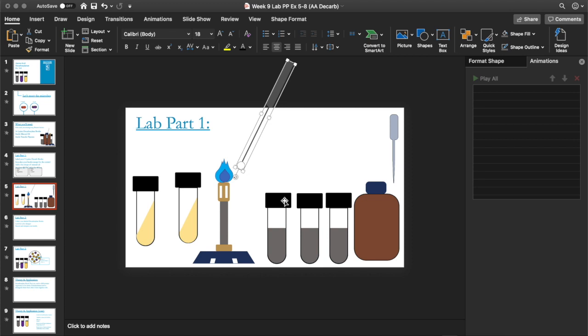Now there's one more step in this lab experiment, and that is to add the mineral oil. This is critical because the mineral oil is absolutely necessary for this test to work properly. So of course, you want to work near your Bunsen burner in order to maintain sterility. What you'll do is just take the top off, use your sterile transfer pipette, grab some mineral oil inside, and pour a few drops into the test tube that you've just inoculated.